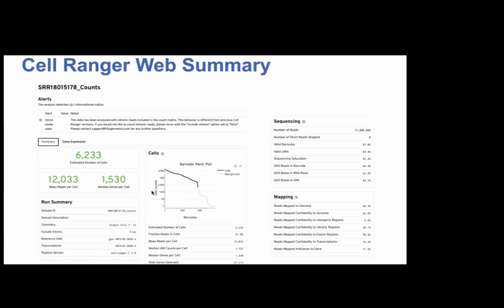And then here you see the UMI count. So there was one cell that got more than 100,000 unique mRNA fragments. But the one with the cutoff is more at like 1,000, right? So there's a wide spread of coverage for these single cells, right? And so you can see this pretty quickly in this summary. And it will tell you how many reads aligned. So I gave it like 75 million, and then most of them had a barcode, stuff like this. You'll find that all here.